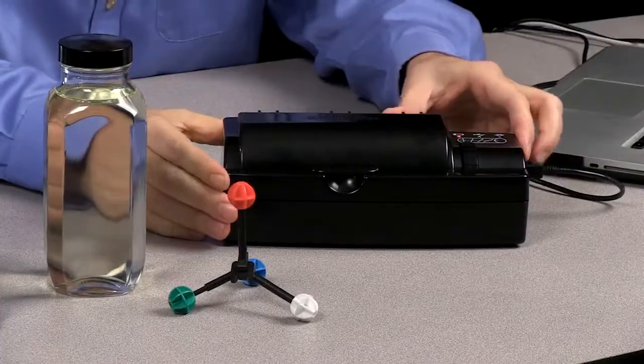Hi, I'm Tom Loschiavo, the Chemistry Education Manager at PASCO Scientific, and I'm here today to talk about the PASCO polarimeter.